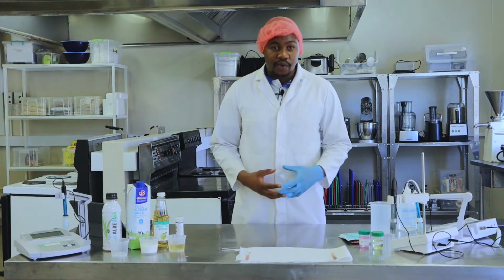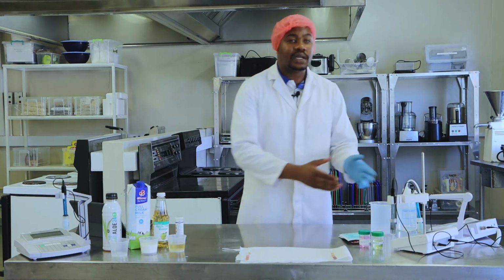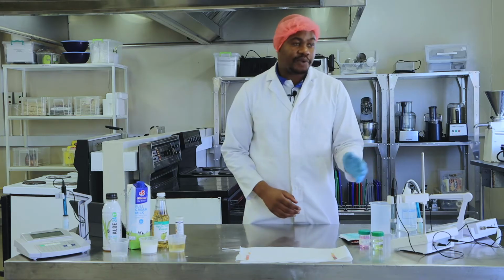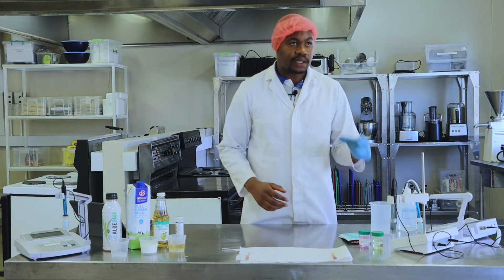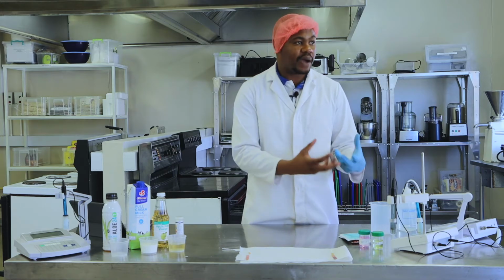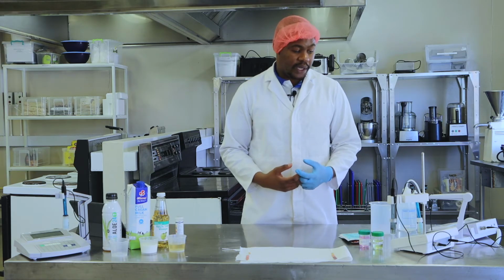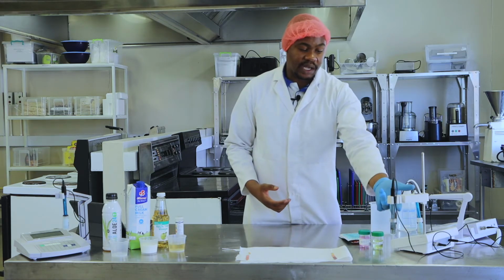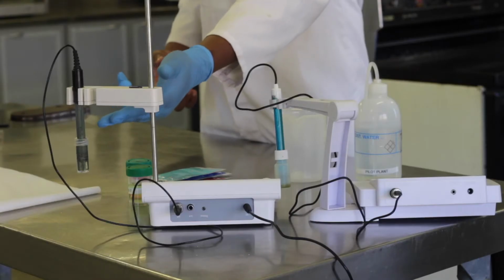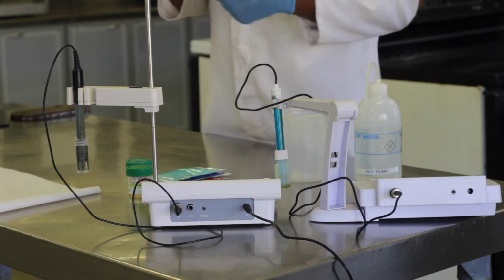A tool that we can use to evaluate the pH of various food products is a digital pH meter. The difference between a digital pH meter and the test strips is that a digital pH meter will give us a quantitative number that we can use. So how does a digital pH meter work? A digital pH meter has a probe, and this probe is always kept in solution so that it does not dry out or form salt crystals.